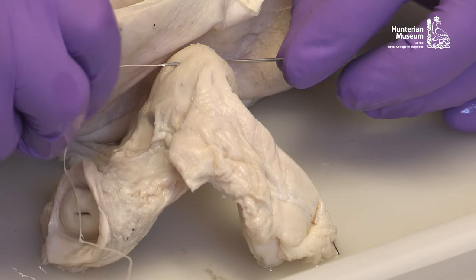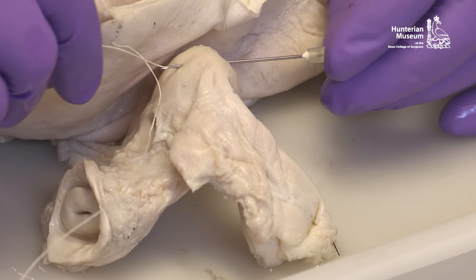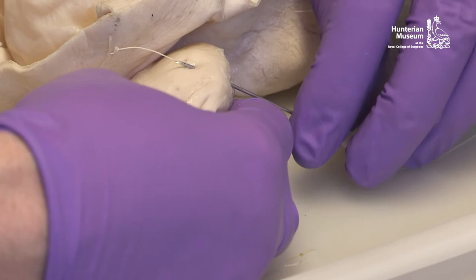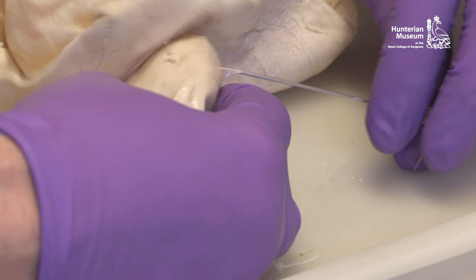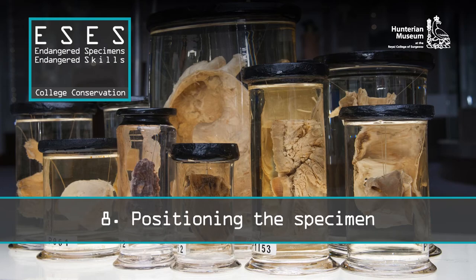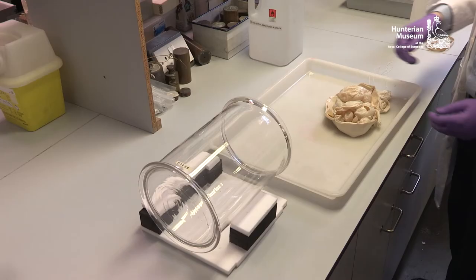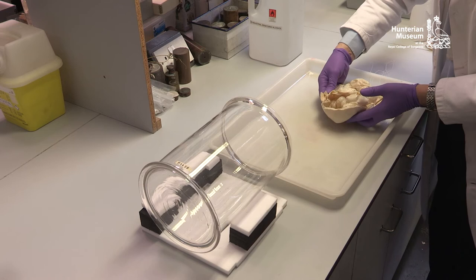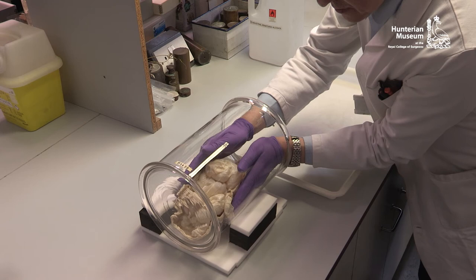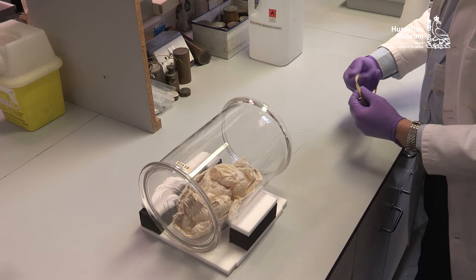Care should be taken not to damage the wax coating on the linen thread. If this occurs, a new thread should be used. It can be beneficial to place the jar on its side so the specimen can be carefully positioned with the threads hanging loose from the jar. Elastic bands can be used to retain the threads while still allowing movement of the specimen.